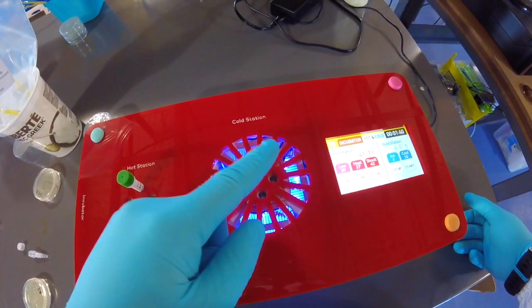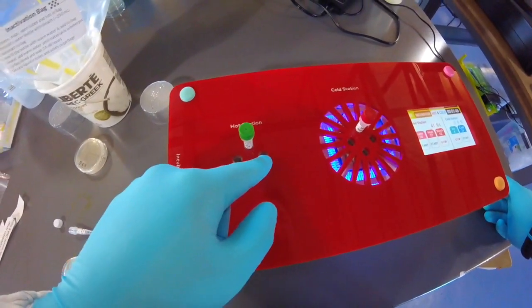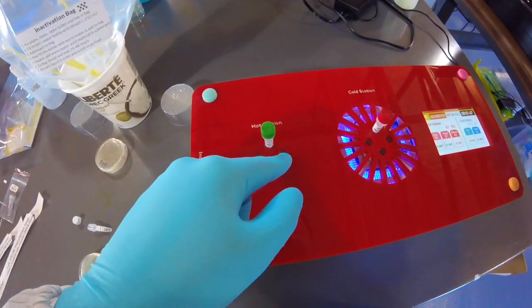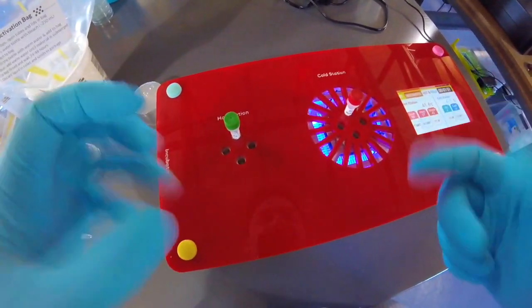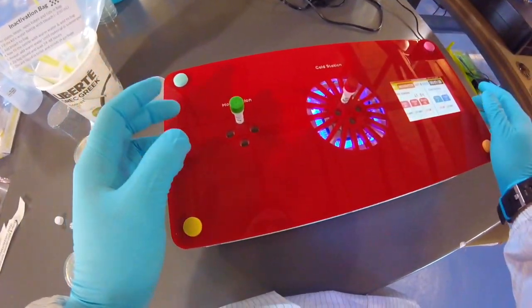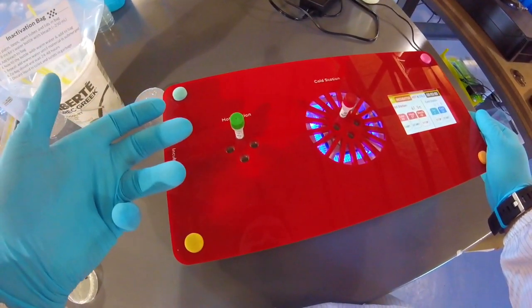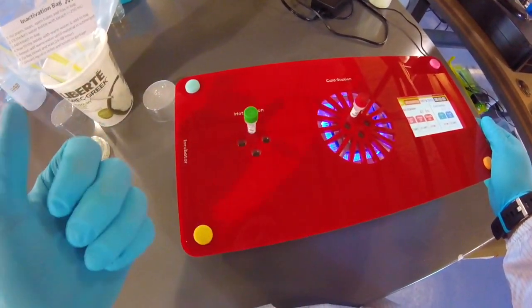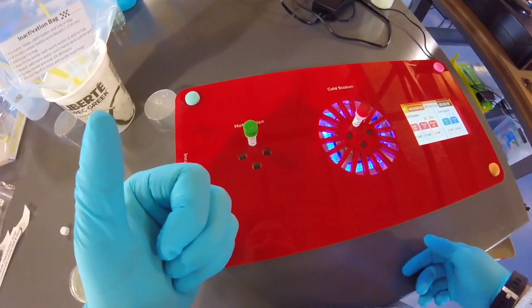So in the next step, we're going to move these cells to the hot station for 90 seconds, and this is going to warm up the liquid with the cells, and the cells are going to warm up. The lipids in the membrane are going to move around a lot more, become more, we'll say, liquid in a way, and that's going to make the membranes more permeable, meaning that things can get in and out of them easier, including the DNA, and so that'll help the DNA get into the cells, all right?